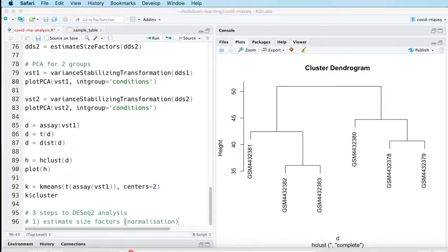Okay, it's to do with this picture that I've drawn. I've tried several times to draw a schematic of a sequencing flow cell, and every time I try to do that, I always end up not being able to use my whiteboard for some reason. It's extremely frustrating. It's loaded, hooray! But of course now my Surface is disconnected from the internet, so you can't see the things that I'm actually drawing. Right, here we go.